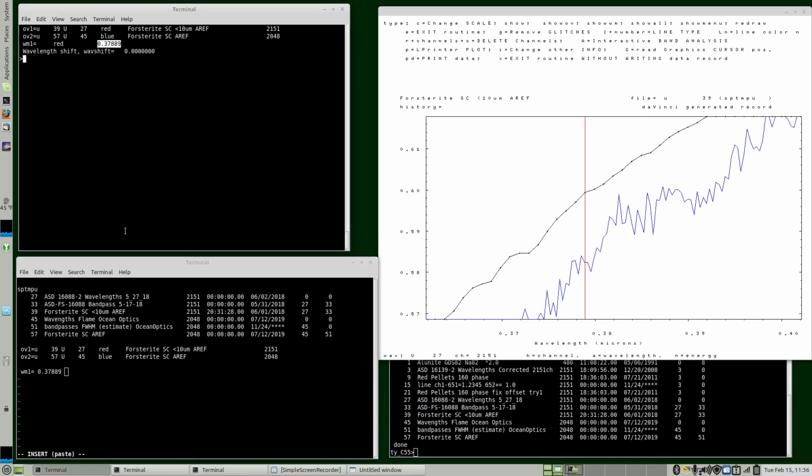One thing to note, one wavelength marker can have up to 5 wavelengths, so we put the color first so we can list all 5 if we need them. But when you enter it, the red should be a comment. So if we cut and paste that, it works. If we just grab this line and pasted it here and then pasted it into Specpr later, the red would be confused.